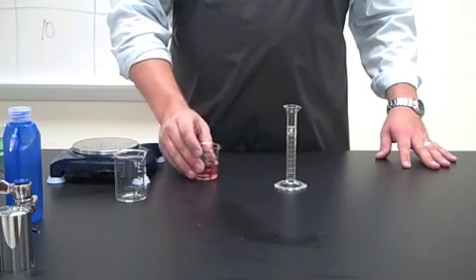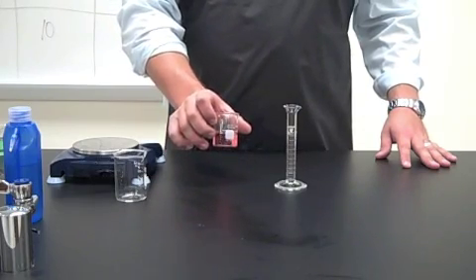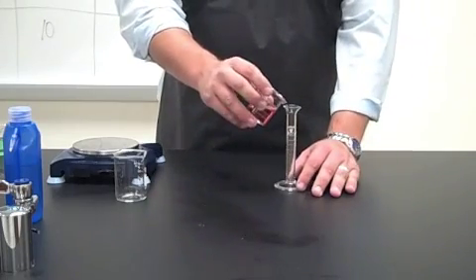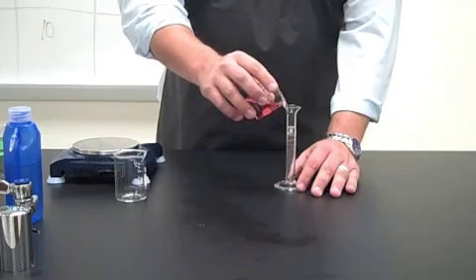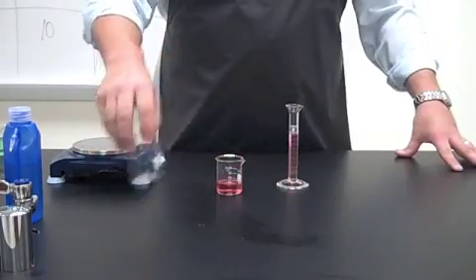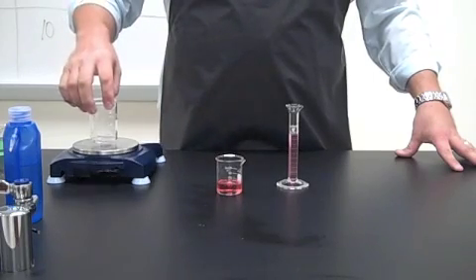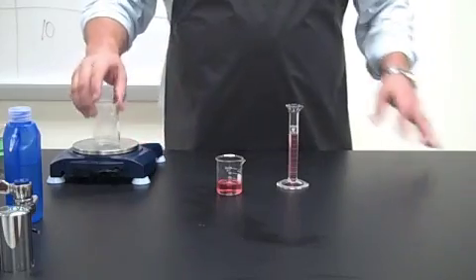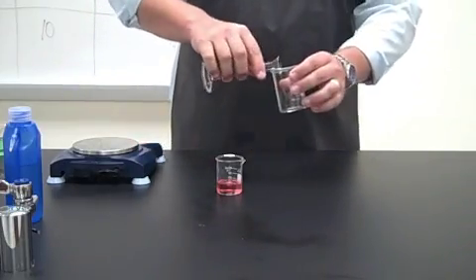And we're going to finish with our reference samples by finishing with the red, which has 20% sugar. Go ahead and pour 10 milliliters. Take our beaker again, put it back on the balance, zero it out, and add the 20% sugar solution.